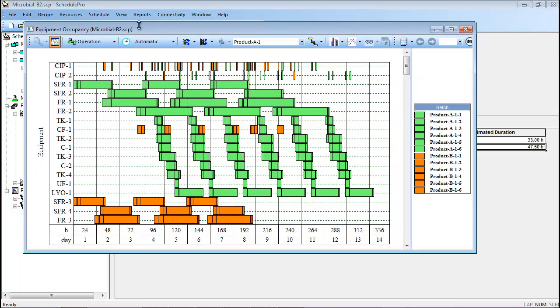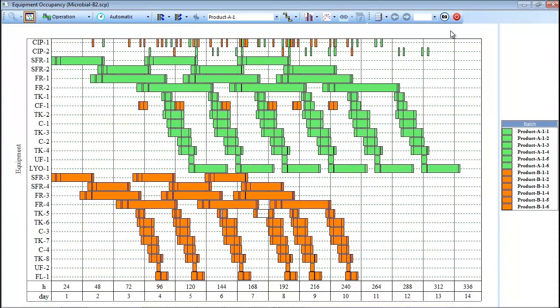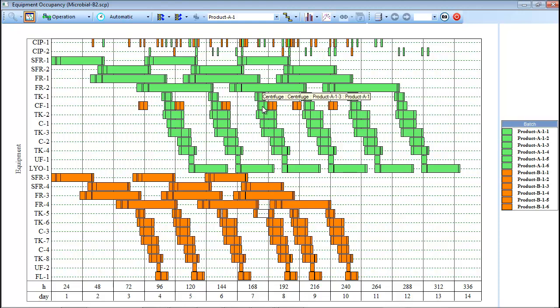The resulting EOC is shown here. Note that in some cases, both campaigns require use of the same equipment item simultaneously. This is why there is a gap prior to the pump-to-centrifuge operation in tank TK5 here. The third batch of the Product A campaign requires the use of centrifuge CF1 at the same time. Therefore, the material in tank TK5 cannot be pumped to CF1 until the centrifugation associated with Batch 3 of the Product A campaign is complete. The determination of which campaign gets to use the equipment item or other resource first is based upon the prioritization of the campaigns within the production schedule. Additional information on prioritization of campaigns is available in case B2 of the README file associated with this example.